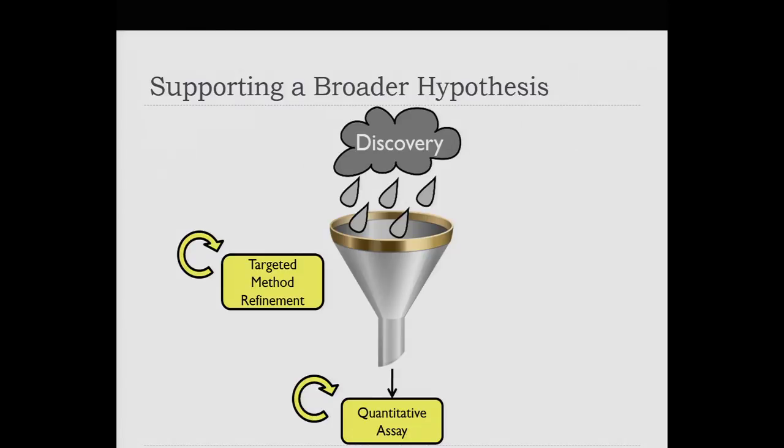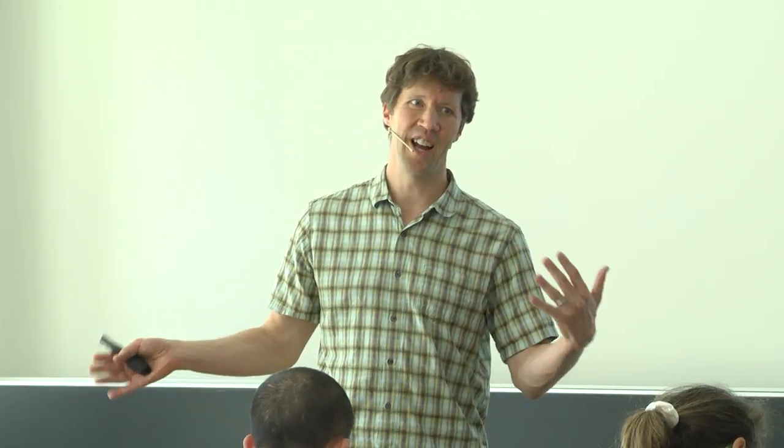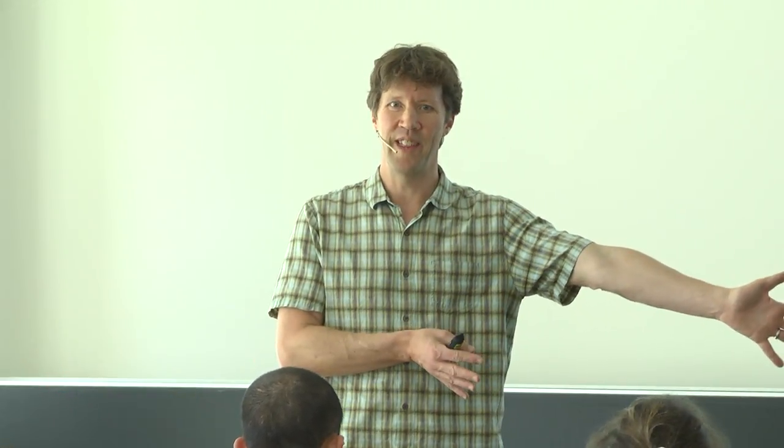So this Skyjam is focused on some work that we did pretty early when we had started Skyline around this idea of method refinement. In targeted proteomics, unlike DDA shotgun proteomics, where you're frequently collecting data and then you're stuck with that data set, and then you analyze it, and there's not really that much of an opportunity to go back and retry it after you've learned something.